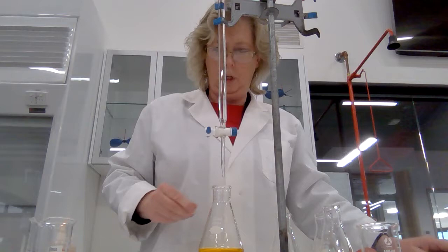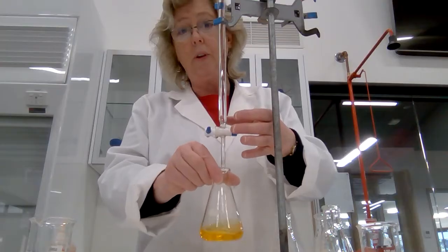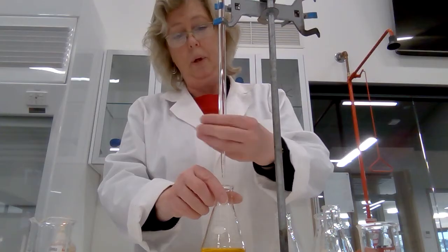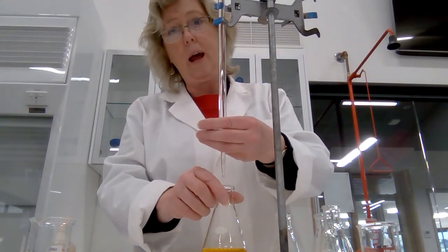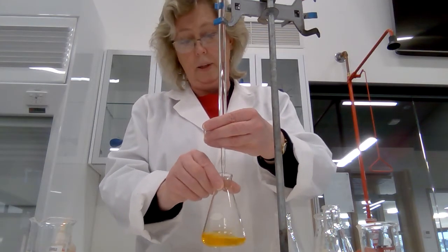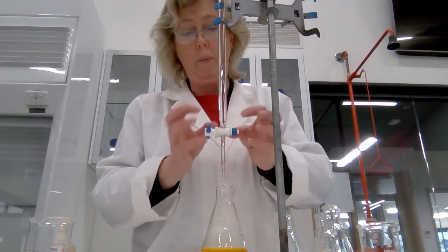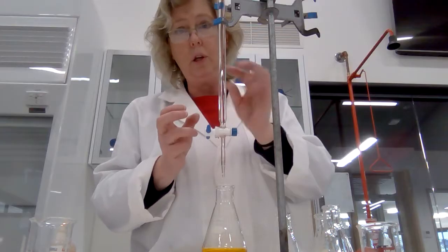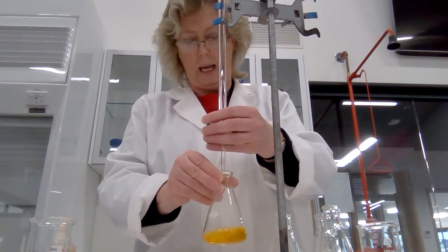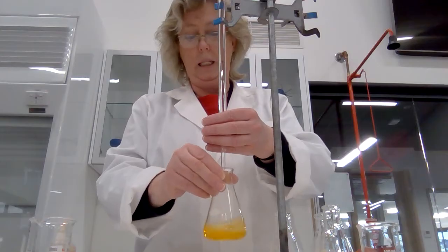I'm using my right hand to swirl the flask and my left hand is operating the burette tap. I've got my fingers around the back of the tap and I'm using my fingertips to control it. If the tap showed any signs of wanting to slip out, we'd be holding it in place, and you also have really good control with your fingertips as long as you practice.